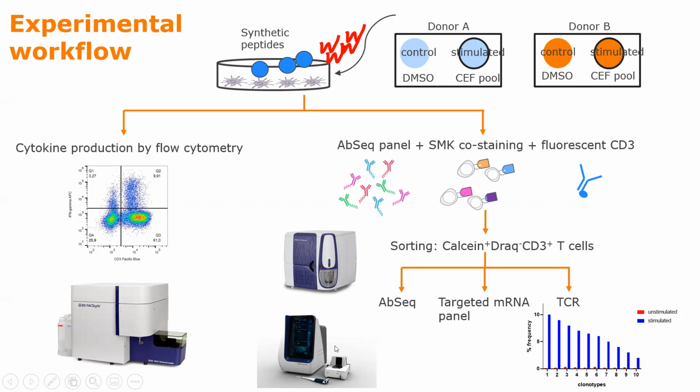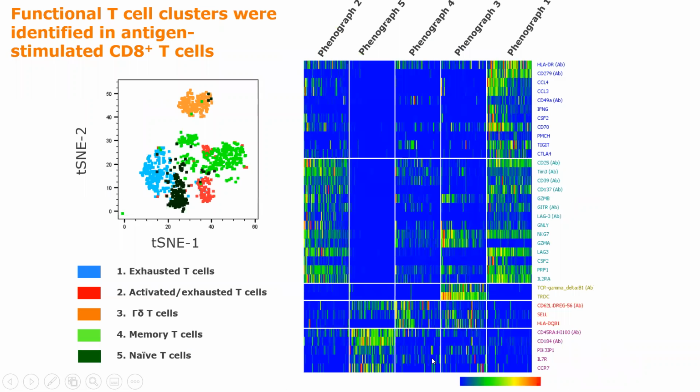We generated our Ab-Seq and Sample Tag libraries, targeted mRNA panel, and our VDJ transcript library, and then we sequence them.